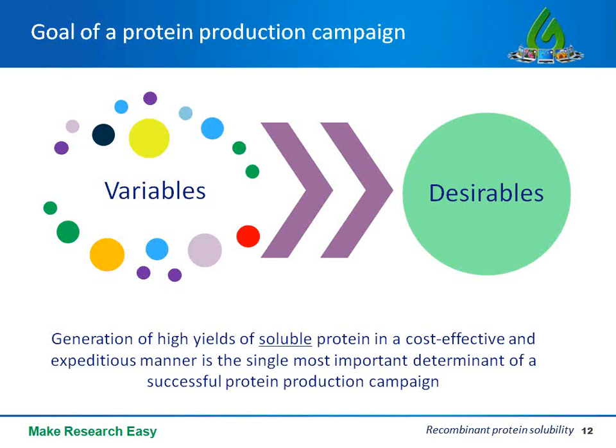Now I know there will be skeptics out there who are listening who will tend to disagree with me, and sure enough, with reason. Solubility need not be the be all and end all of a protein expression campaign, but for most purposes protein solubility often becomes a direct or indirect measure of protein quality.